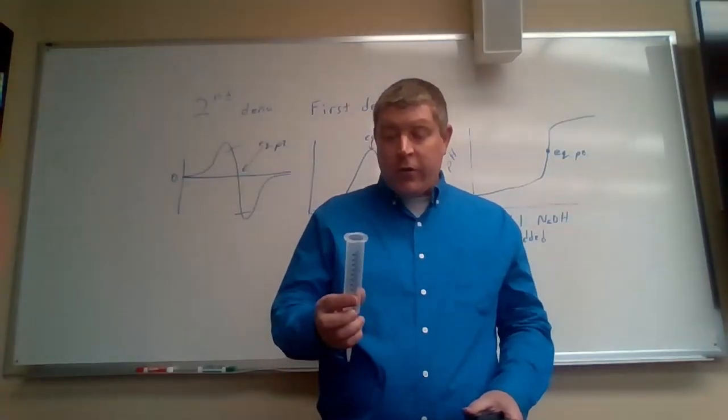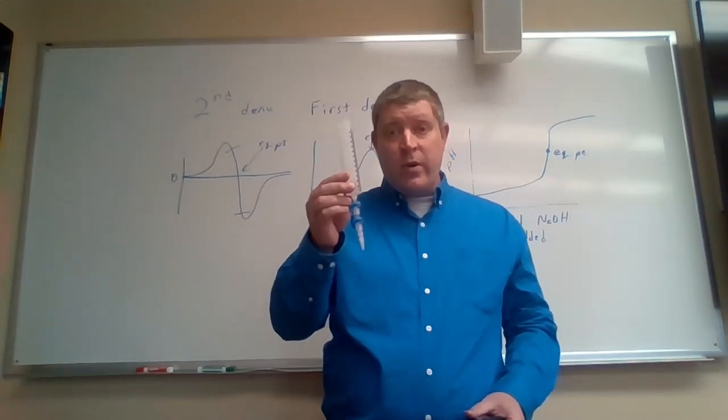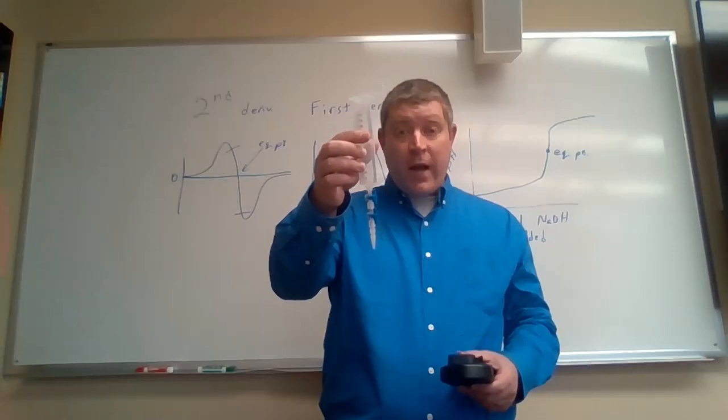You're also going to take that solution and put it into a reagent reservoir that functions similar to the burette. That reagent reservoir is going to look something like this. There are going to be 2 valves on them.